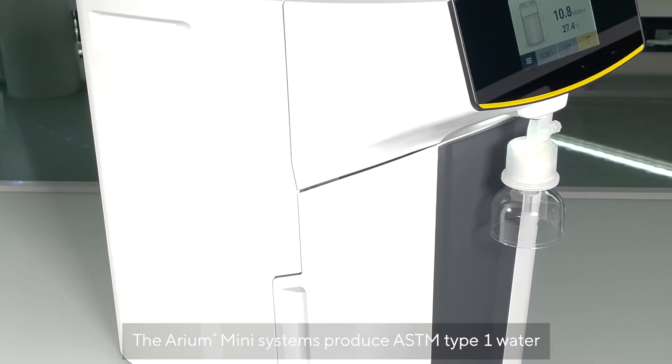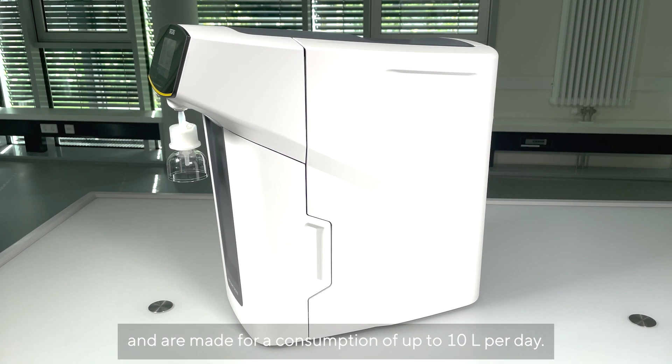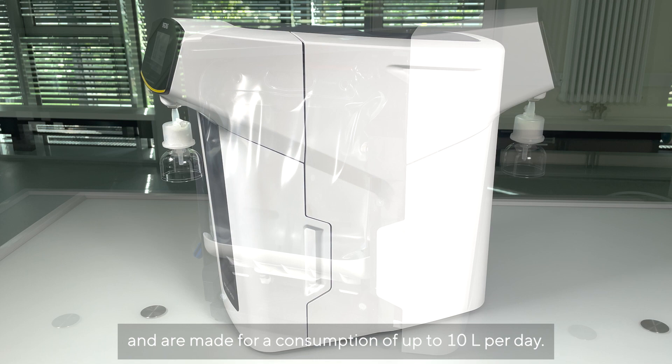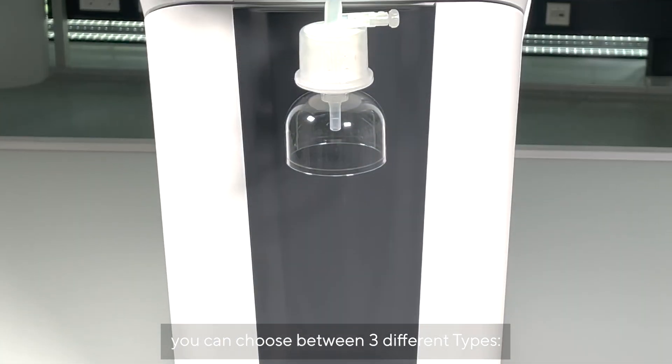The Arium Mini systems produce ASTM type 1 water and are designed for consumption of up to 10 litres per day. Depending on your available feed water source, you can choose between three different types.